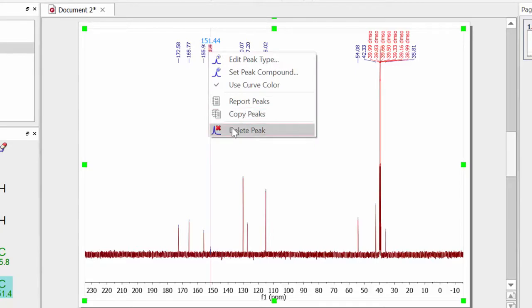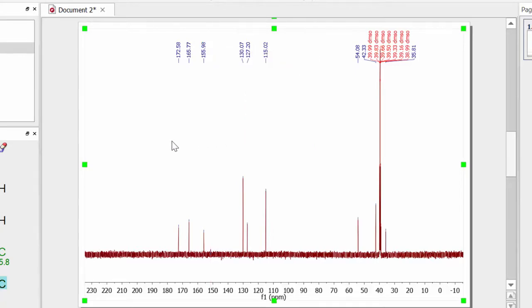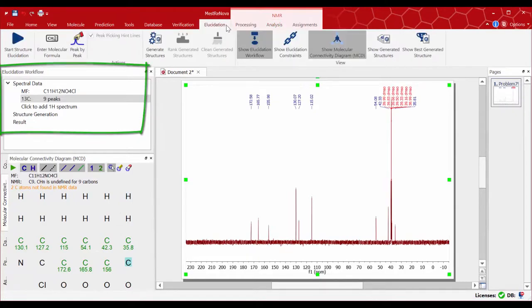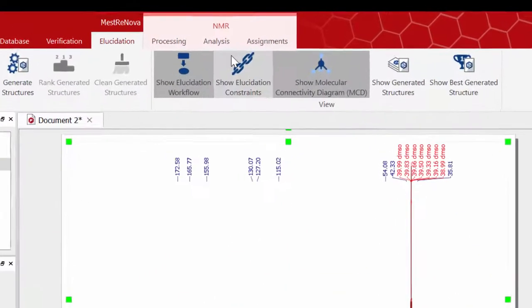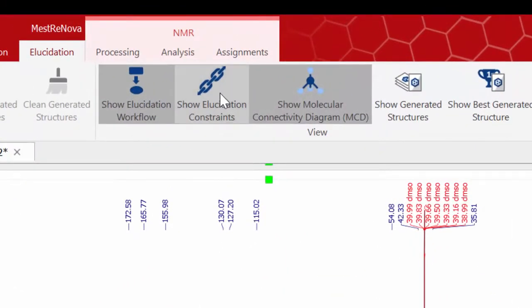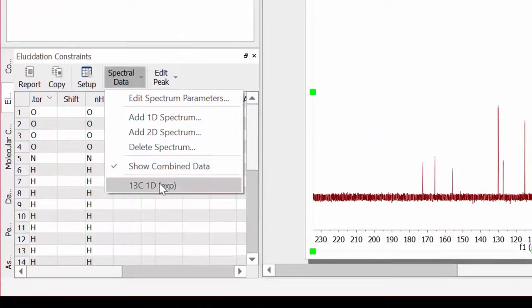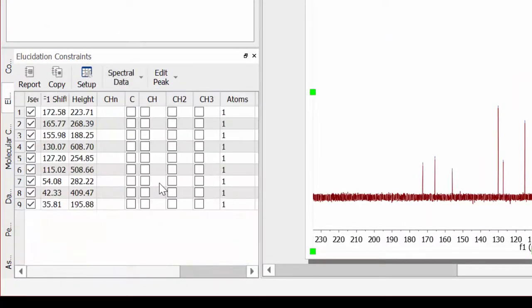On the spectral data window you can see there are nine carbon-13 peaks out of the expected eleven. What we need to do is go to the elucidation section and select the 'Show Elucidation Constraints' spectral data tab. Use the drop-down menu and select the 1D carbon experiment.